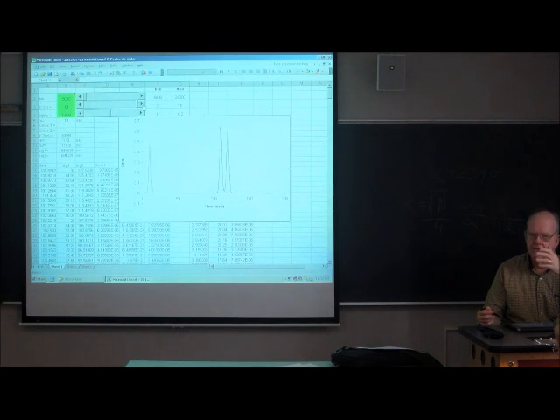In ion exchange chromatography, you would lower the ionic strength of the eluent, or you would diddle with the pH of the eluent, depending upon the chemistry of the phase and the chemistry of the ions involved. In normal phase chromatography, you would use a weaker, a less polar eluent than your initial eluent, and you could immediately increase retention.